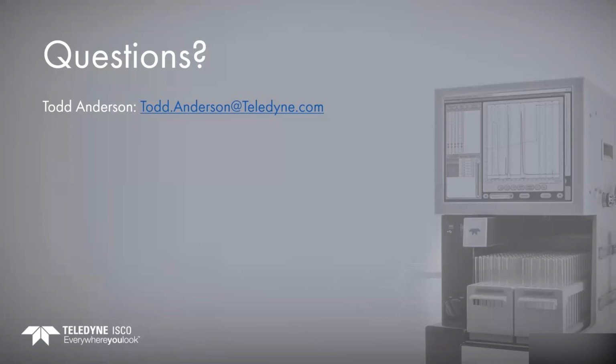So any questions? If not, I can get into some from what we had earlier today. Don't see anything in my Q&A section area. So one of the questions that I had from earlier, showing the slide demonstrating flash and prep chromatography.